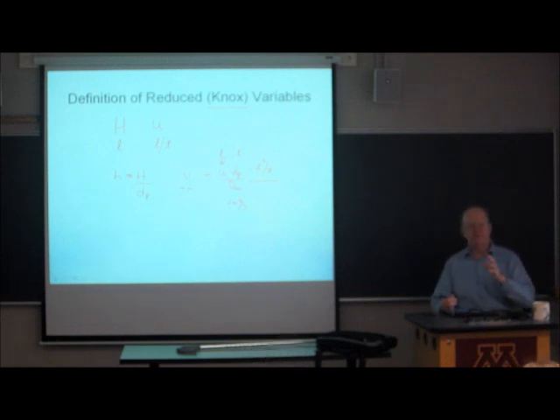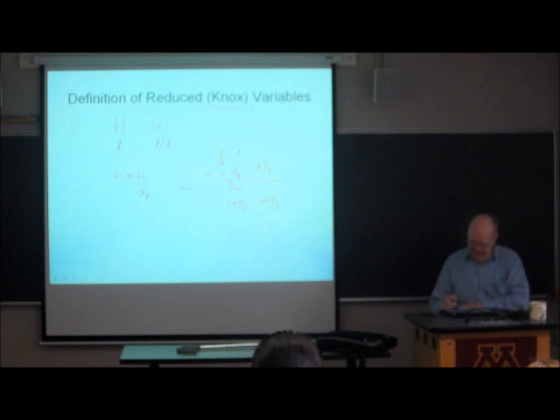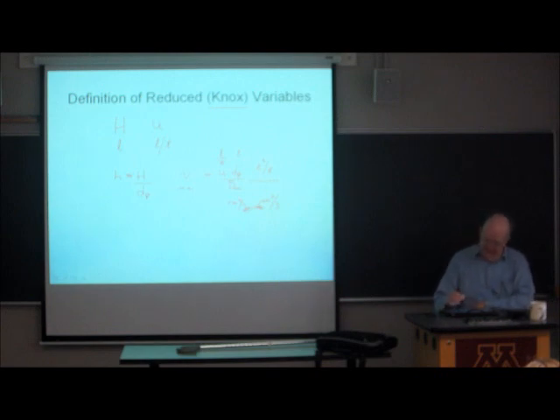By chemist type people. But the engineers, of course, want to be different. So you'll frequently see them, if you're in the engineering literature, in meters squared per second. Just be happy it's not in feet per minute, okay? Excuse me, square feet per minute. And so we have a difference of 10 to the 4 in these quantities, depending upon the units. But taking the units into account, the reduced velocity is a dimensionless quantity.